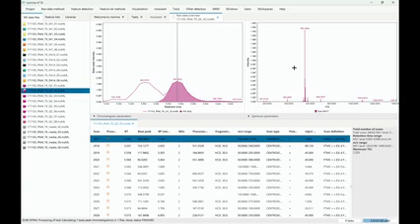So it's raw files from Thermo. We went through MS-Convert for the conversion. And in mzmine, the conversion actually happens in the background, so you don't need to handle MS-Convert. You only install the latest version of MS-Convert, or maybe the version that works best for you, or the Thermo raw file parser. And then mzmine will pick it up in the background and use it for data conversion for you. And again, in the configuration, you can set up if you want to keep these mzML files, so we only convert once and you have the mzML files, or if we should just convert it and then basically scrap the mzML file.